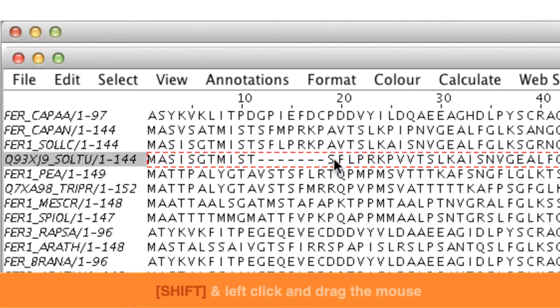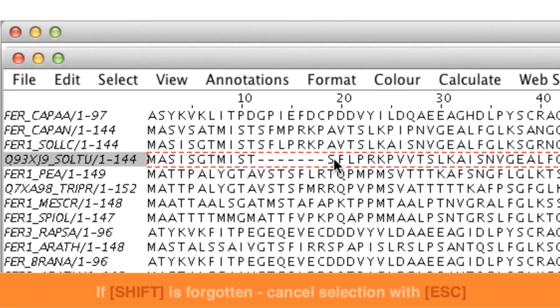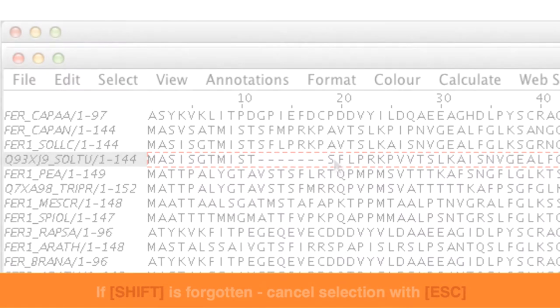If you forgot to hold the shift key down, you will make a selection rather than moving the sequence. This can be cancelled by pressing the escape key.